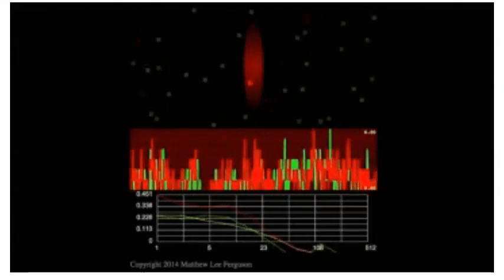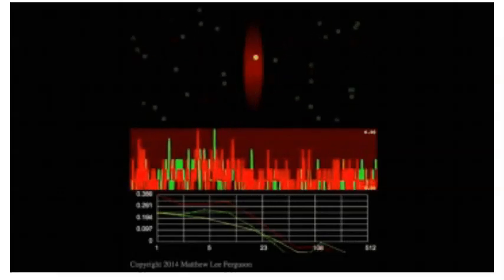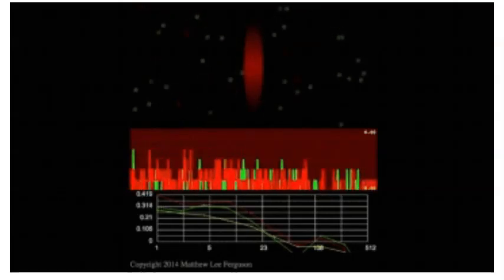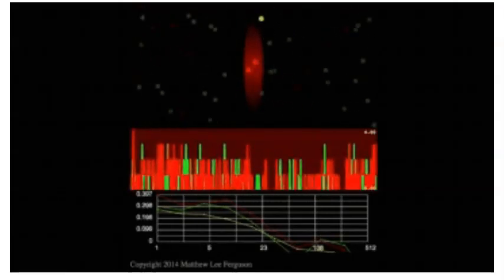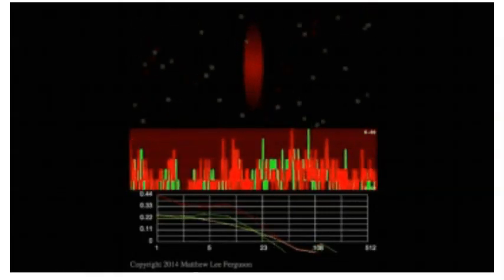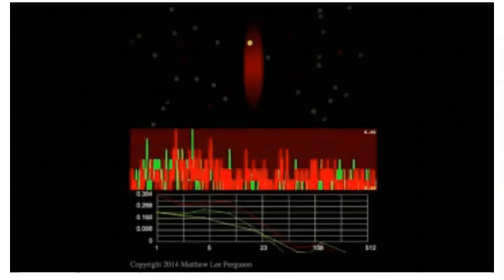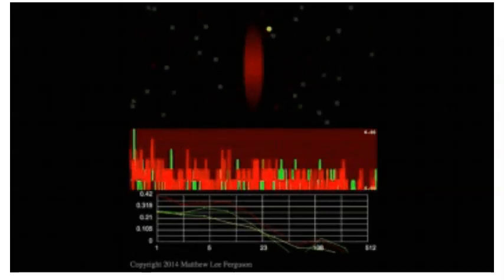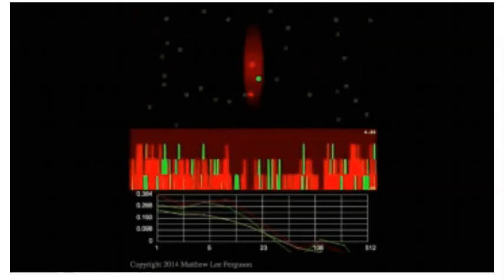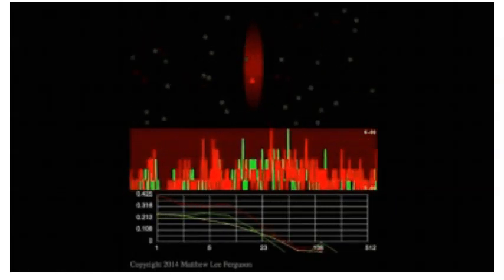This simulation shows cross-correlation measurements in action. The red ellipsoid represents the confocal volume. A minor fraction of the protein population is tagged with red and green fluorescent probes, ensuring that, on average, only one or no tagged molecule occupies the confocal volume at any given time. Yellow dots indicate complexes formed by the proteins tagged with red and green probes. This color scheme is applied to the autocorrelation and cross-correlation functions shown in the lower panel.